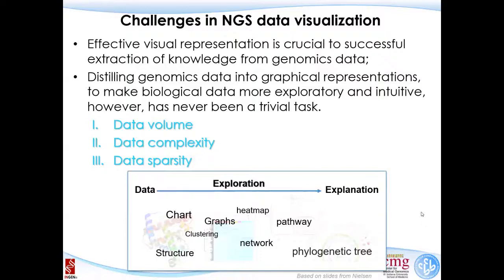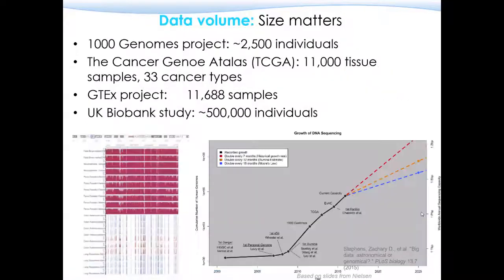However, generating a very good figure from genome data is not a trivial task. It's very challenging, considering the data volume, data complexity, and data sparsity. First is the data volume. From the last few lectures, we've already talked about it.